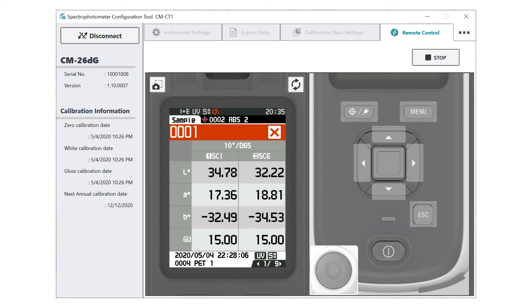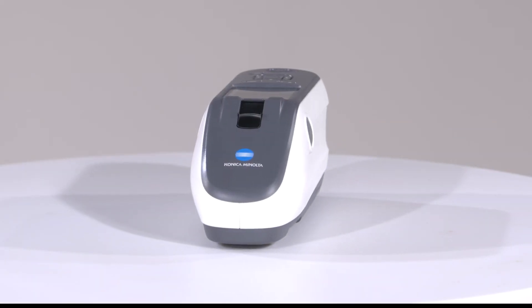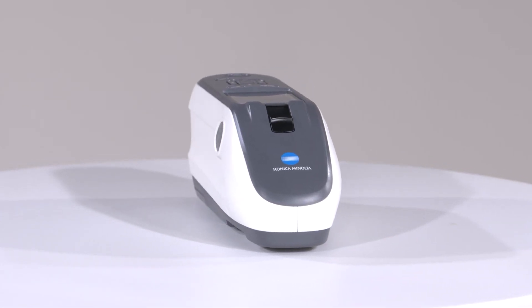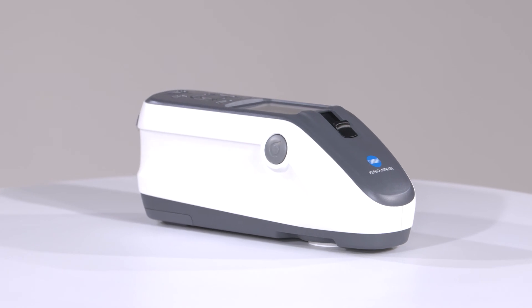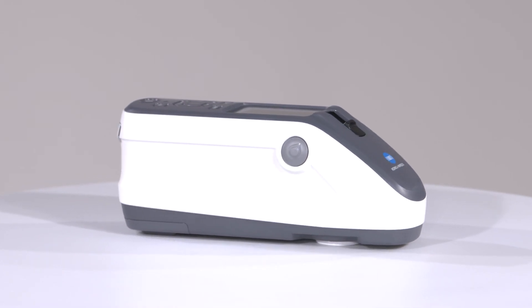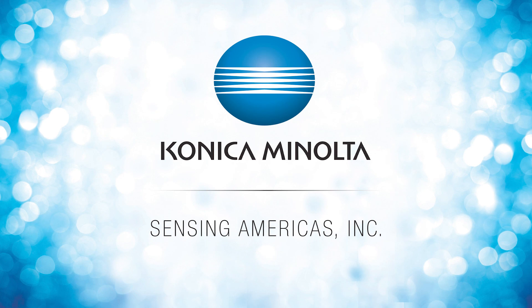The CM26DG provides users with laboratory-grade performance, ease of use, and the ability to measure color and gloss in one reading. With the added flexibility of the CMCT1 tool, settings can be done quickly and establish fleet management. For more information on Konica Minolta's color measurement instruments, visit us online at sensing.konicaminolta.us or call 888-473-2656.